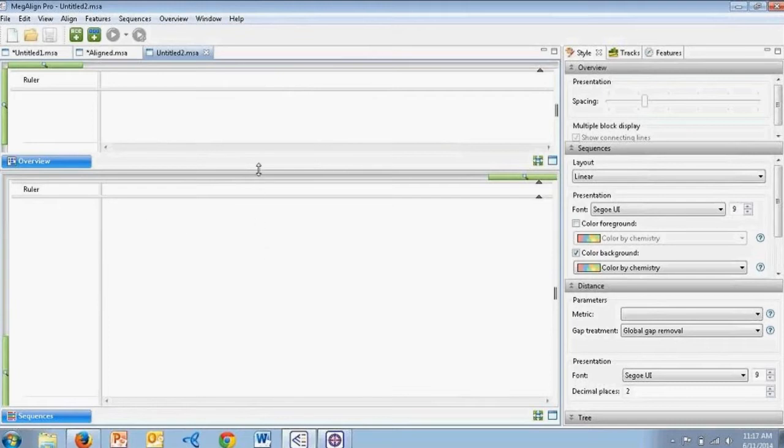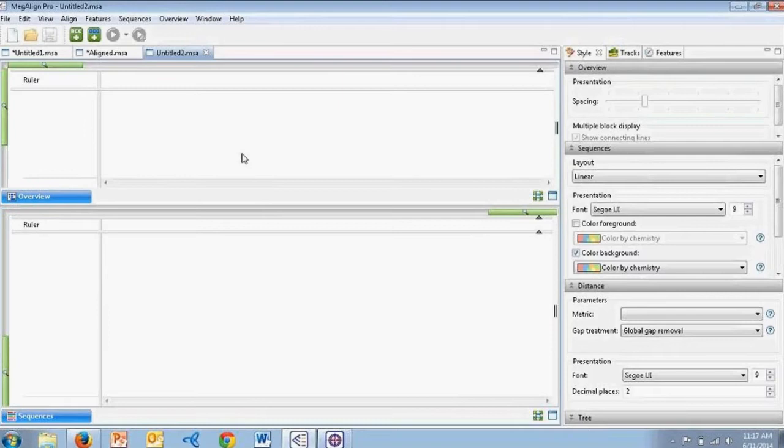For this next example, we're going to look at how to work with multi-segment files in a project. Sequences that consist of more than one chromosome, contig, or fragment are called multi-segment files. So let's say that you want to string together the consensus sequence from all the contigs in an alignment, or all the chromosomes in a genome, or all the exons in a gene.